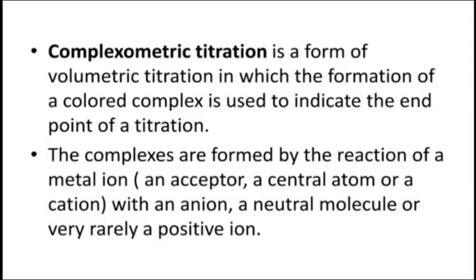It is a form of volumetric titration in which the formation of a colored complex is used to indicate the end point of titration. These complexes are formed by the reaction of a metal ion with an anion or neutral molecule, or very rarely a positive ion.